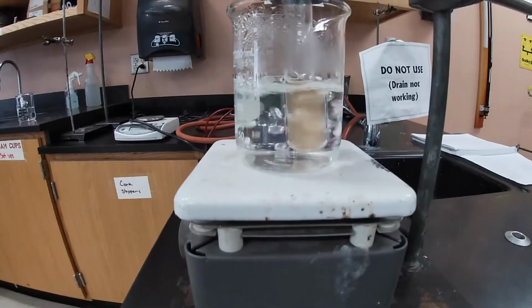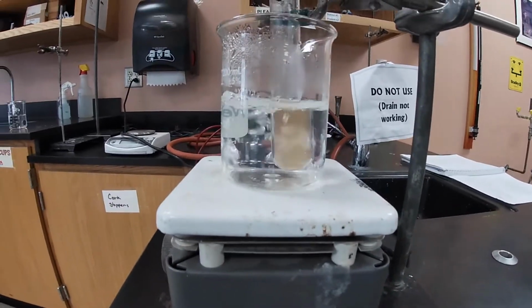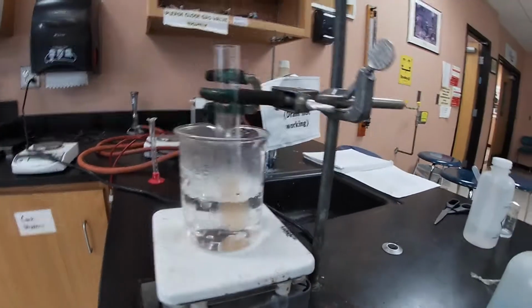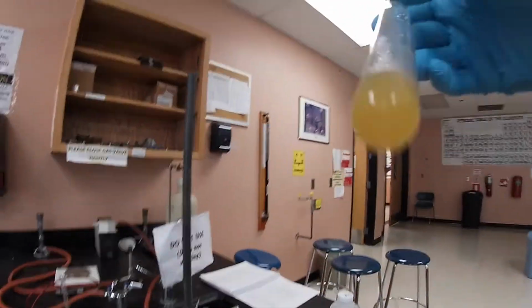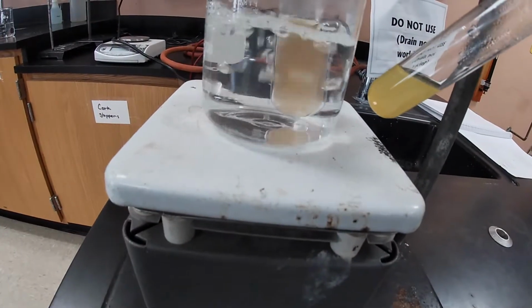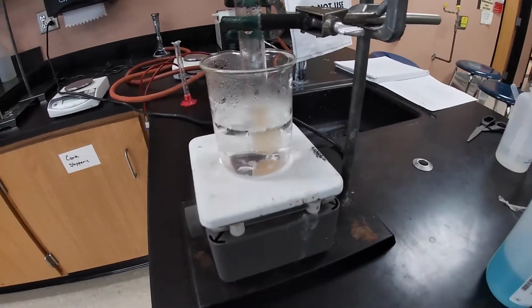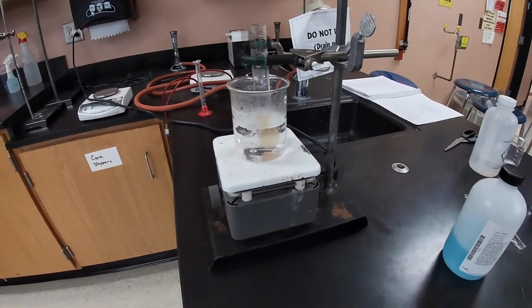Okay, after 5 minutes, as you can see, we got a nice little brown color. So that means that we do have some glucose present, and in comparison, probably not as concentrated, but we do have some glucose in there. And so now all we're going to do is take it out and then compare all 3.